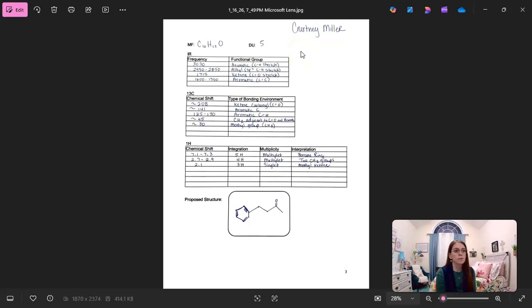The carbon-13 NMR spectrum shows 7 distinct signals, which indicate symmetry in the molecule. At approximately 208 ppm, there is a carbonyl carbon of a ketone. At 141 ppm, there is a quaternary aromatic carbon. Signals between 125 and 130 ppm correspond to aromatic CH carbons.